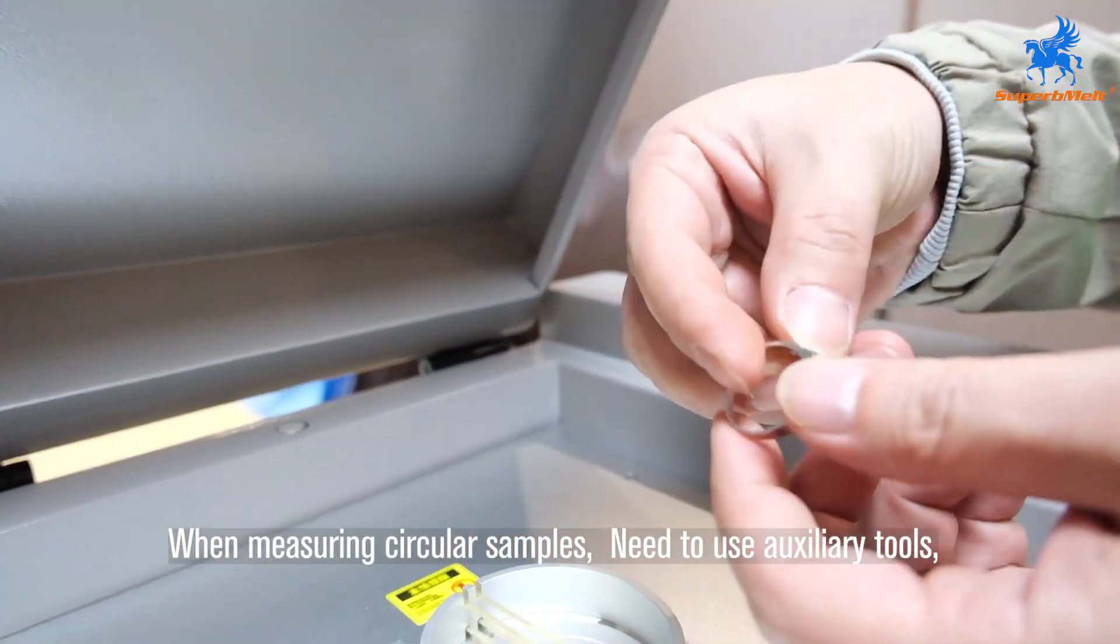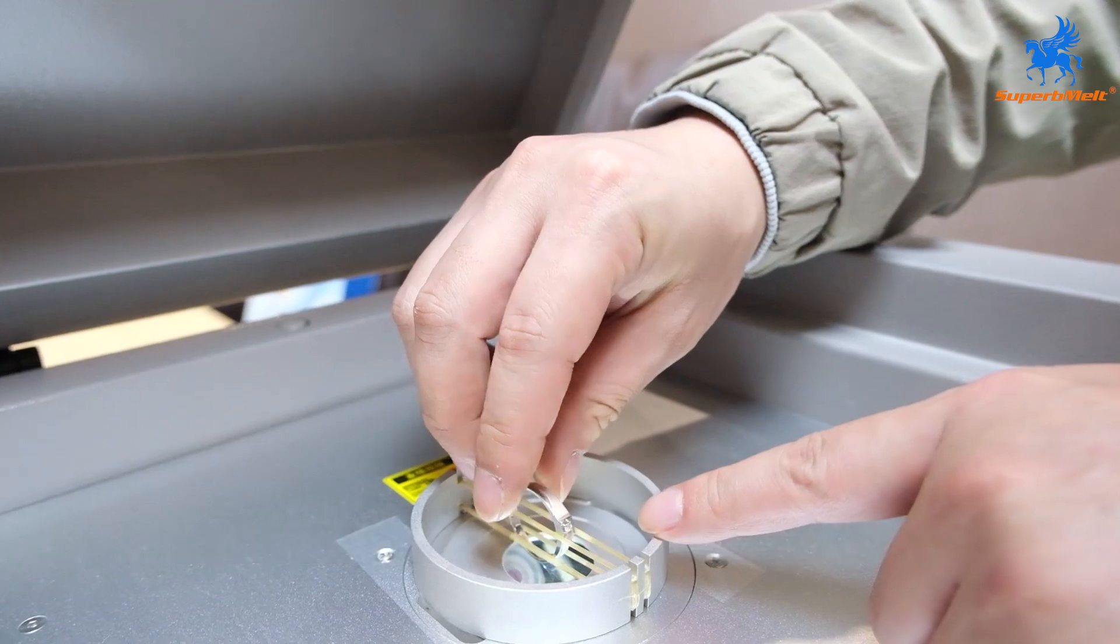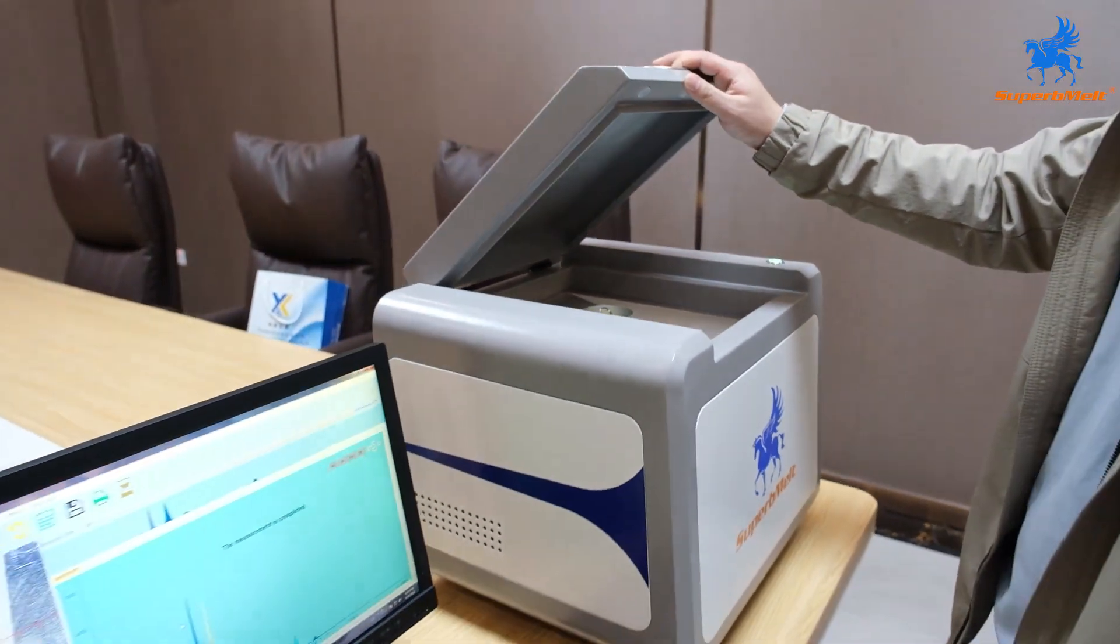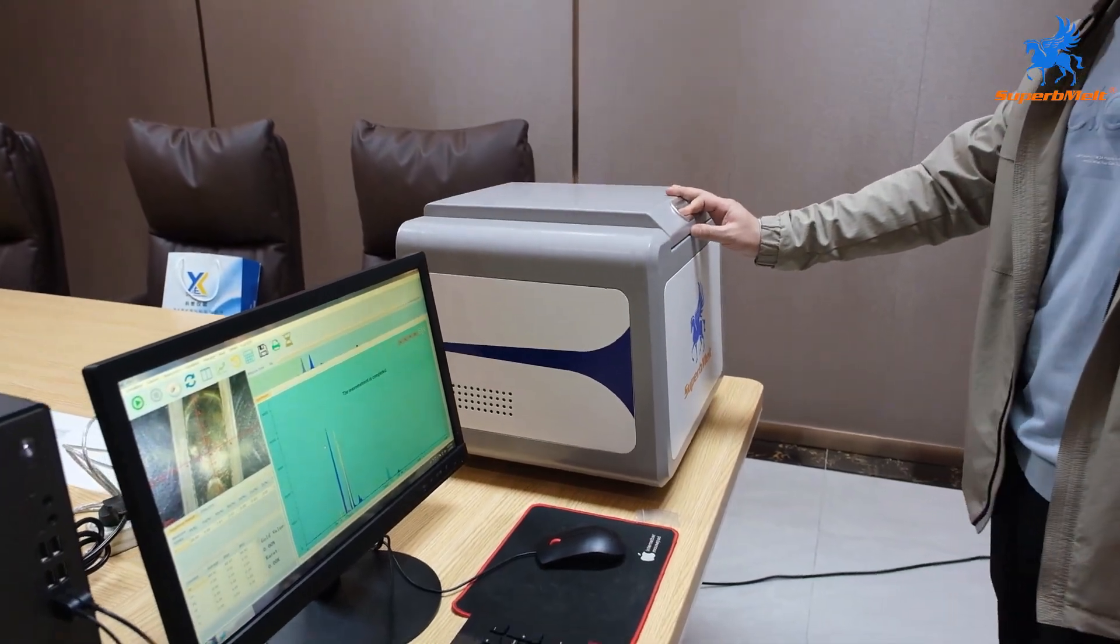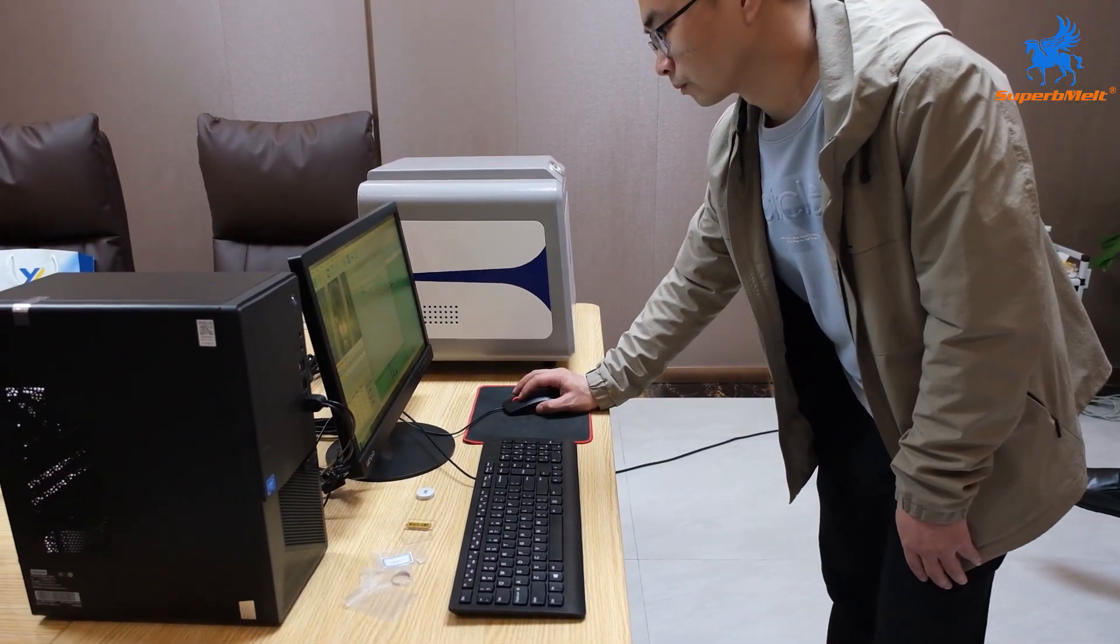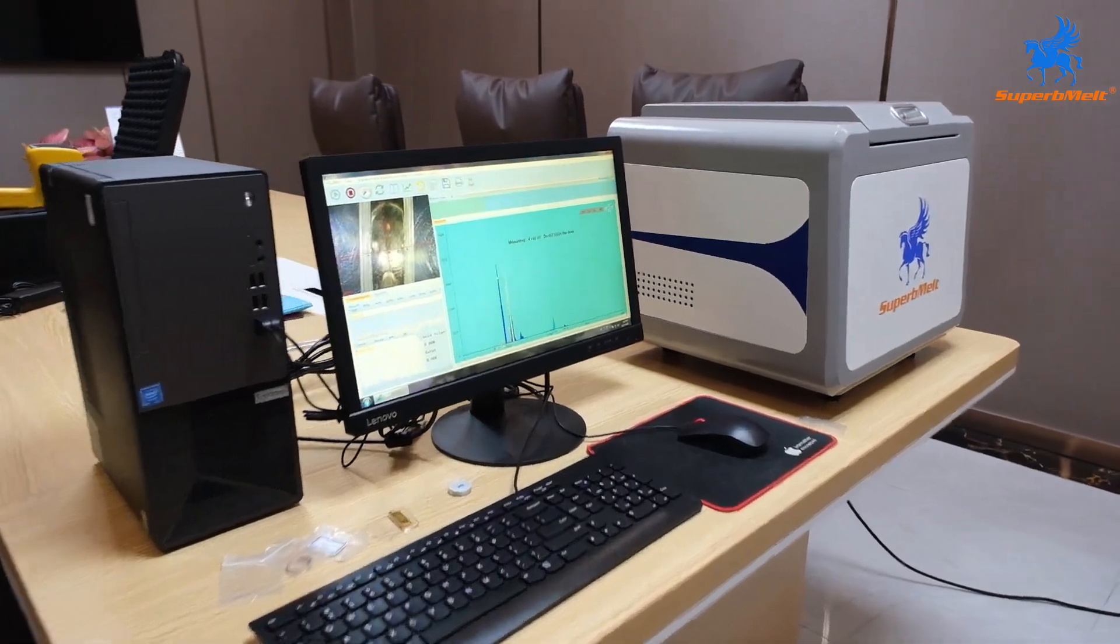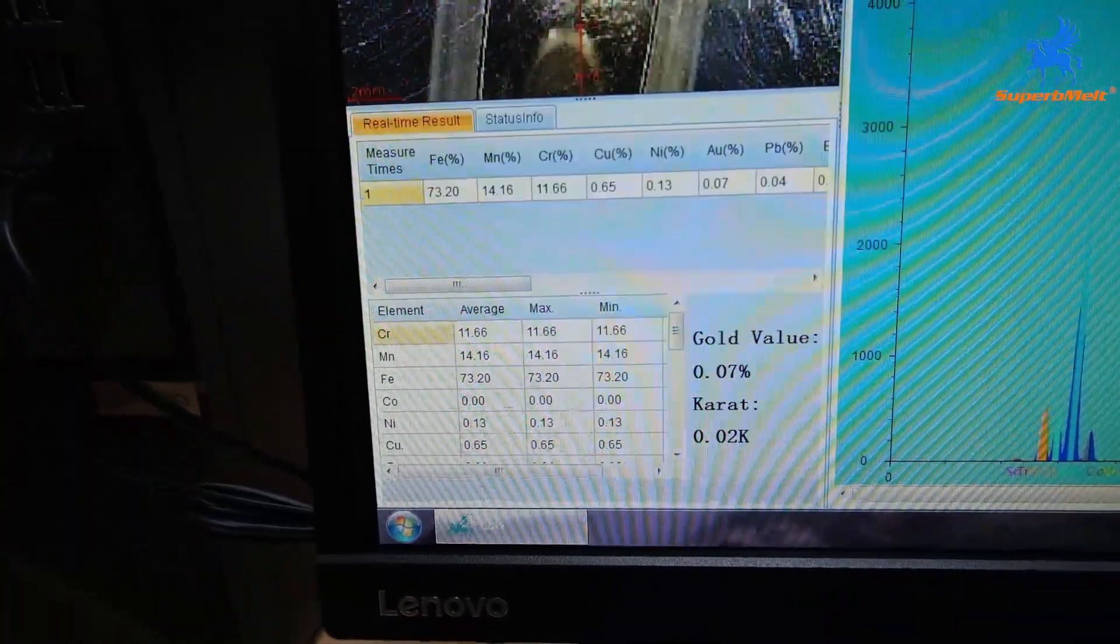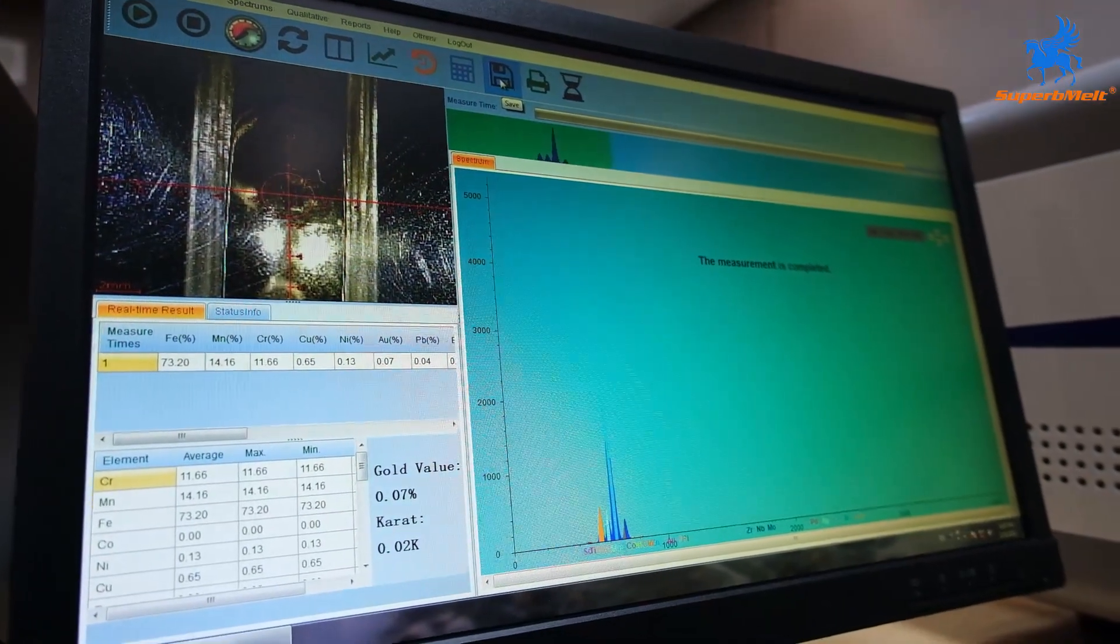When measuring circular samples, need to use auxiliary tools. The results of this measurement show that the gold content is only 0.07%. It can be judged to be a fake gold-plated ring.